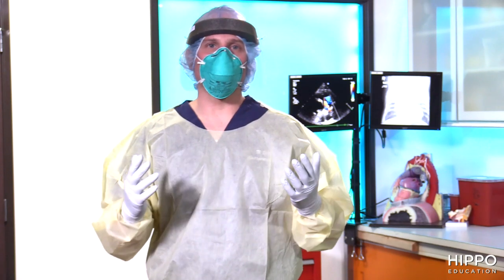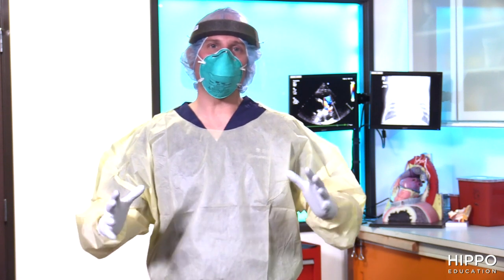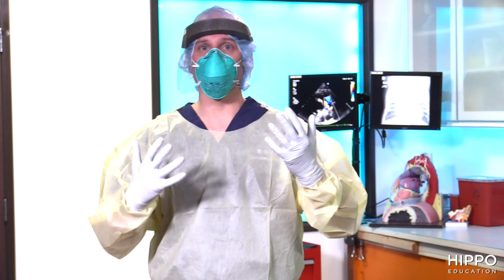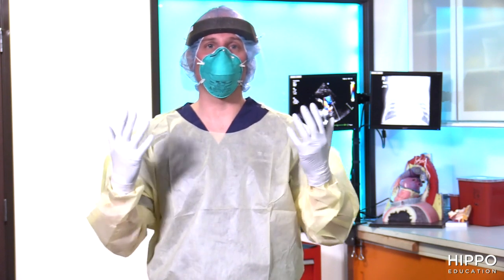We wanted to conduct an experiment here in studio, seeing if our doffing procedure of our PPE is done correctly. So what we've done is we've aerosolized a fluorescent material onto my PPE, as if it was someone coughing or you're in the room with a patient where you may have had aerosolized particles and virus.